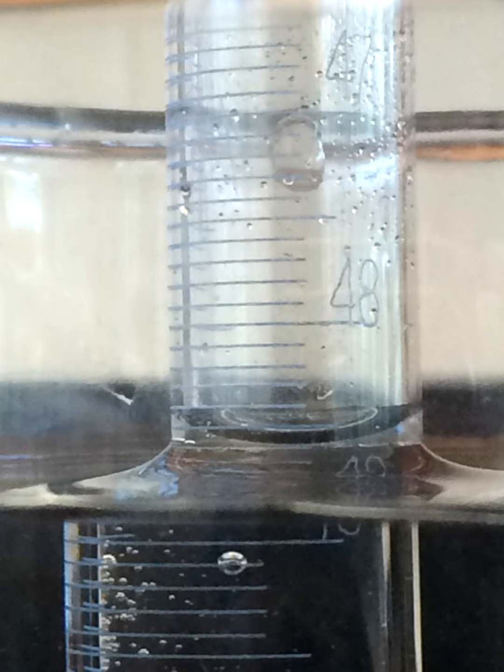At this point, the final volume in the eudiometer is measured. Be careful that this is reading down instead of up like most graduated devices typically read.